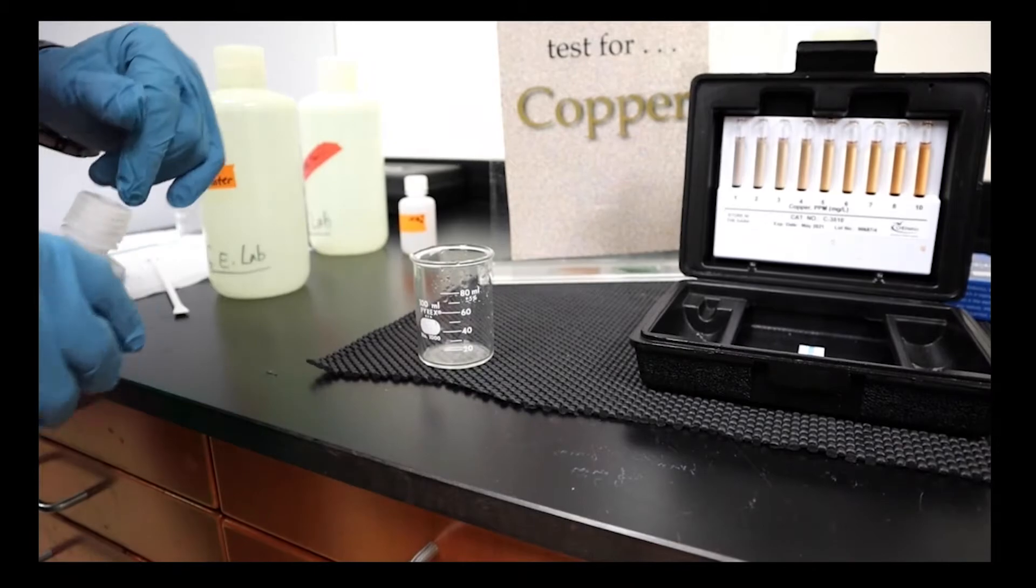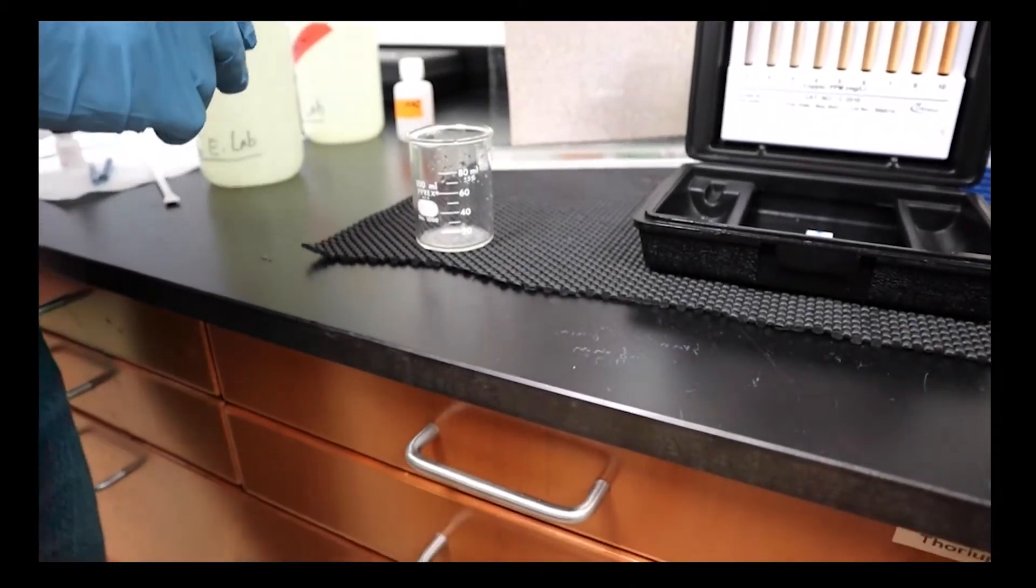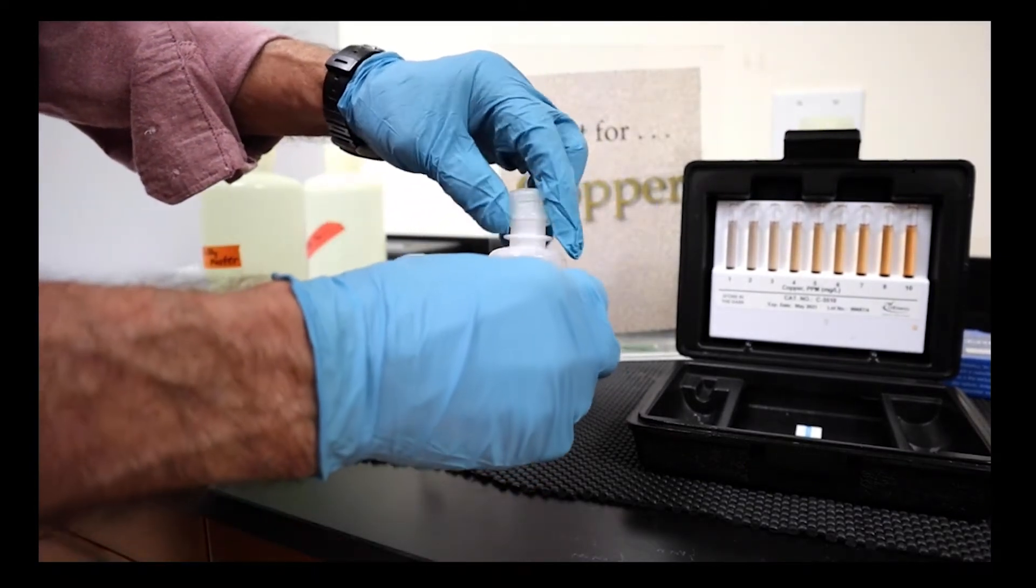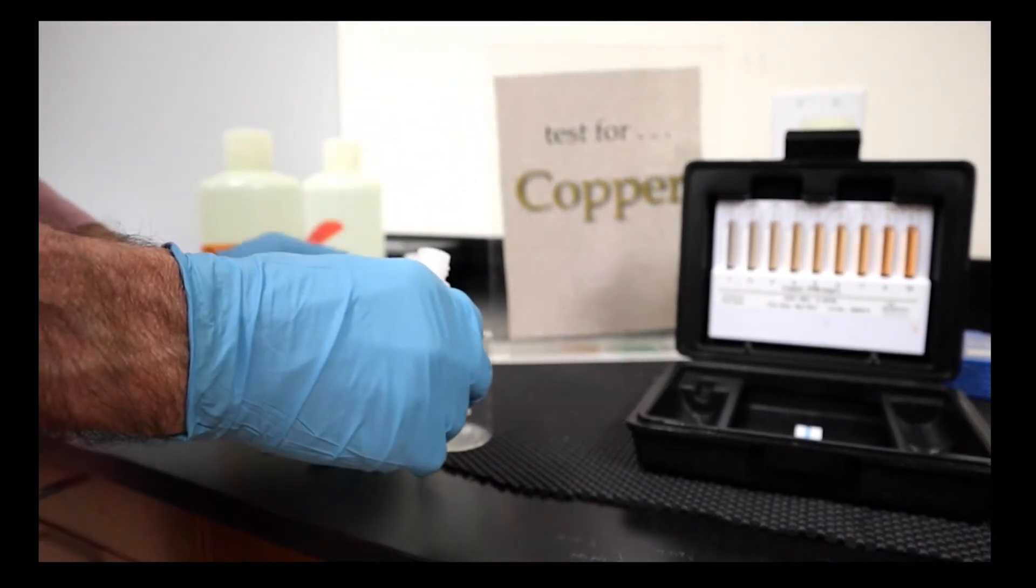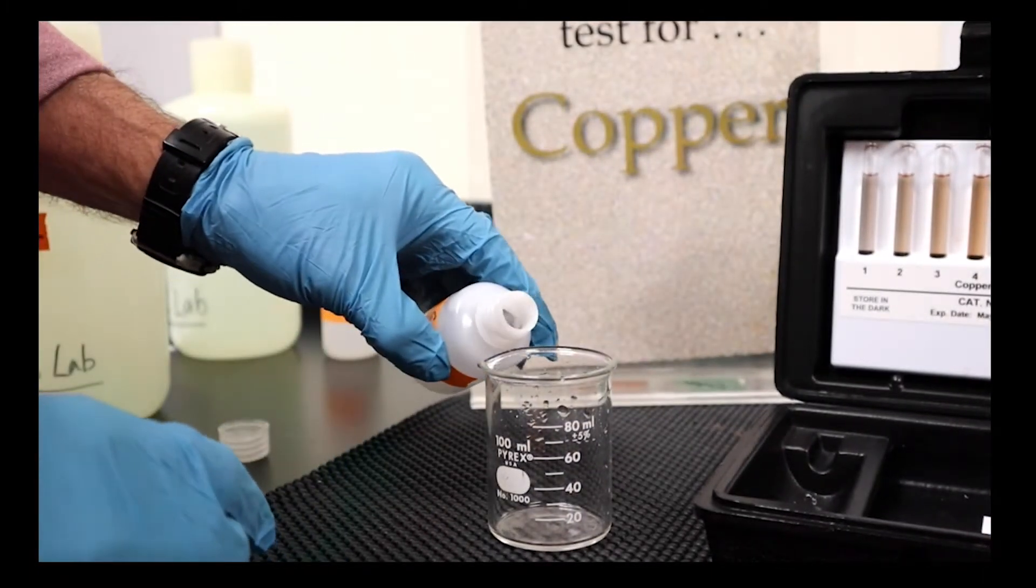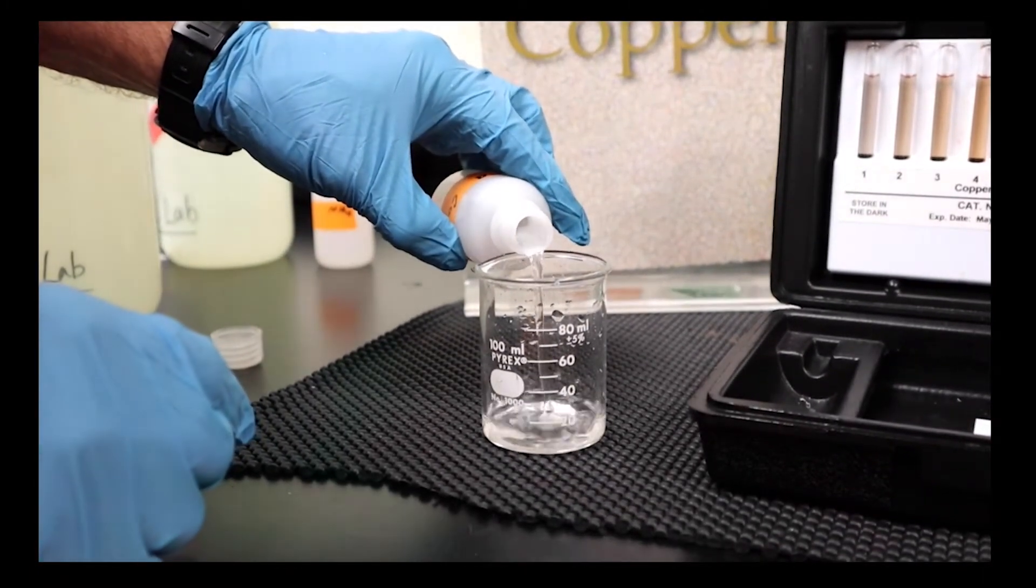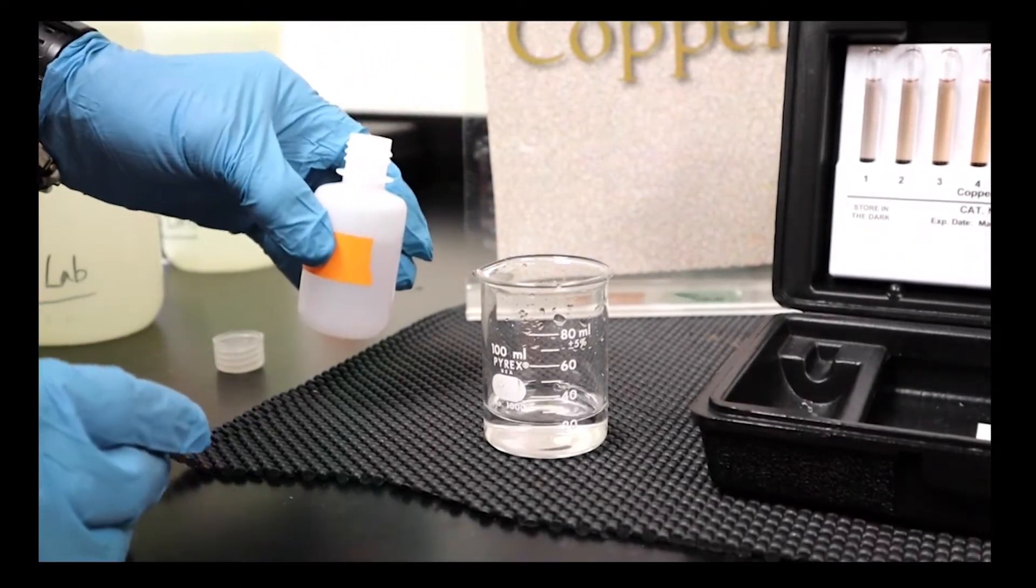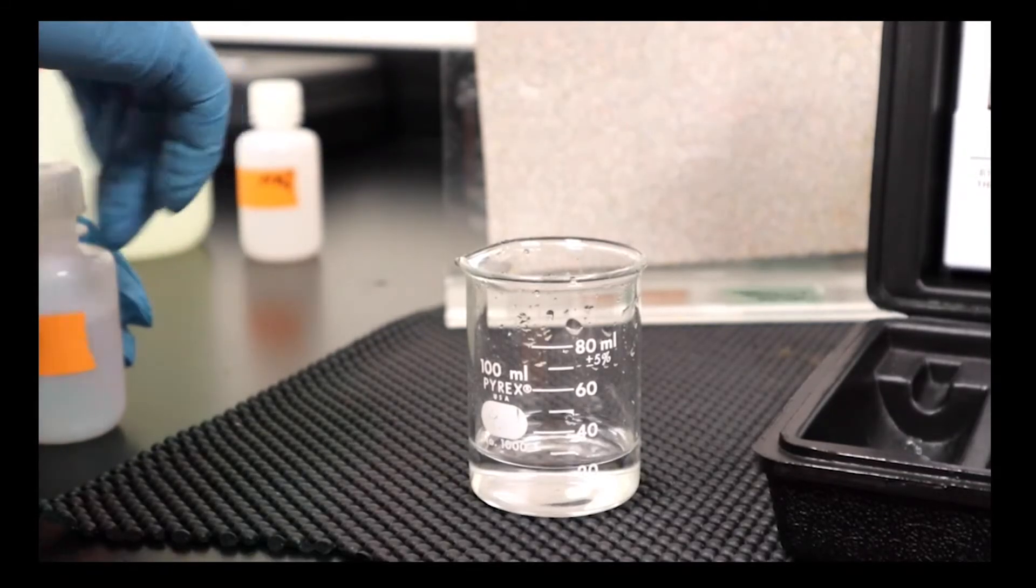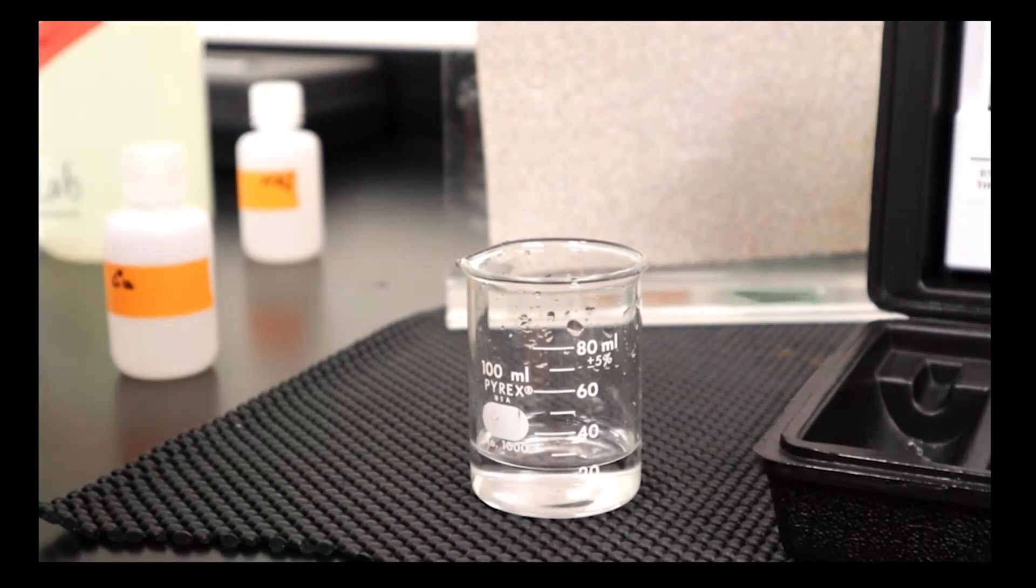Let's look at our second contaminant, and that will be copper. This time we're going to start with the B sample. We'll add a bit to the beaker, try to get right around 25 cc's in there. We're at about 25 cc's.